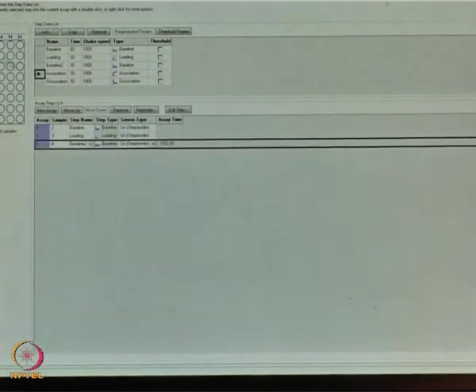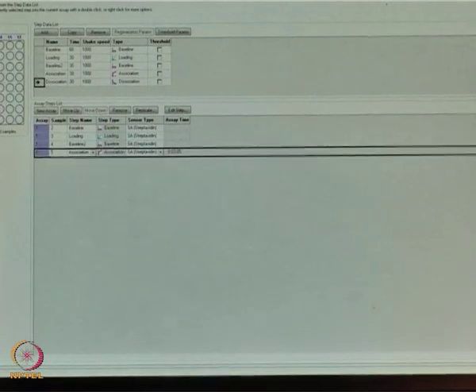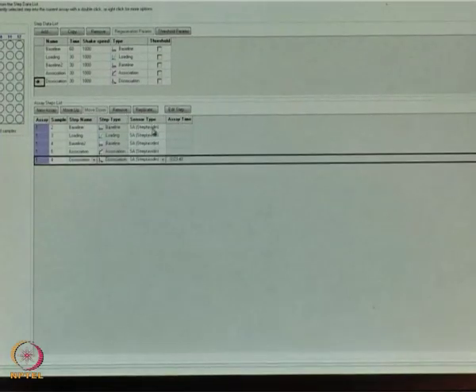Next step is the association step. This is the sample, the mouse monoclonal antibodies, twofold diluted, 6 data points. Then the dissociation step, I am performing in the same buffer, that is column 4. These are the steps, and the type of sensor we are using is the streptavidin sensor.